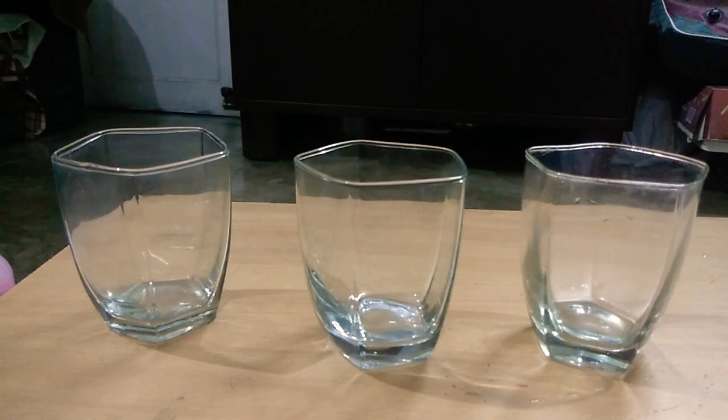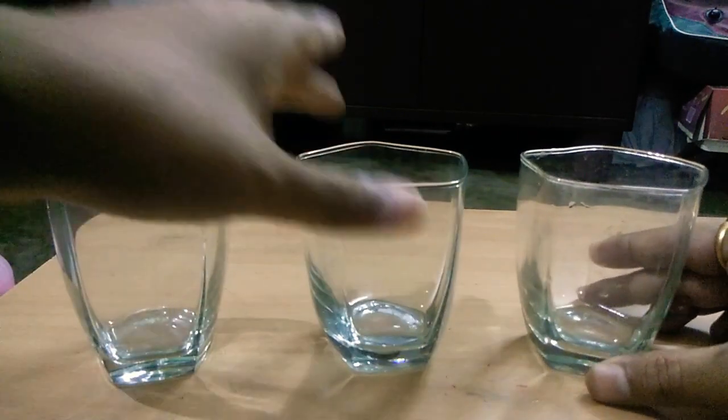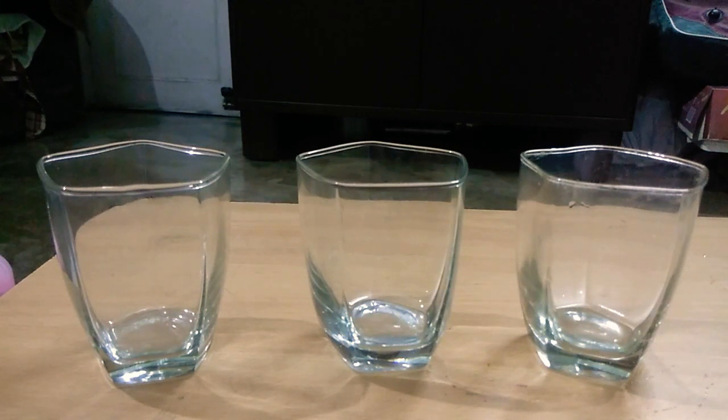Another type is the heterogeneous mixture, which is of two types. One is called colloids. Milk is a very good example of a colloid. And another one is the suspension. Suppose sand in water, that's a suspension. Colloids and suspensions are heterogeneous because the particles are not uniformly mixed. So we'll try to create the three types of mixture, that is solution, colloid and suspension, and try to see the difference between them.